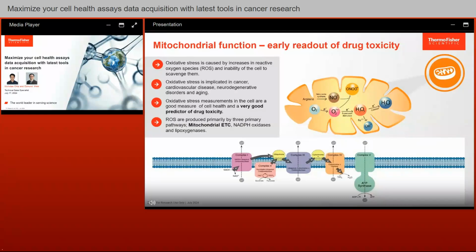So in both cases, they are a good mechanism for representing a classical tool for identifying the mechanism of action in drug treatment, or understanding how a gene has altered the metabolism of a cell, particularly with the mitochondrial phenotyping.